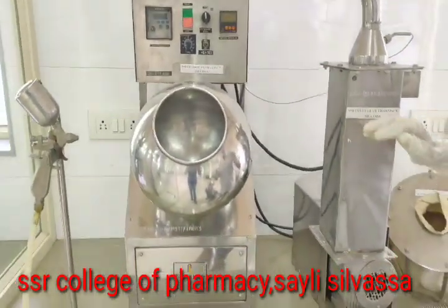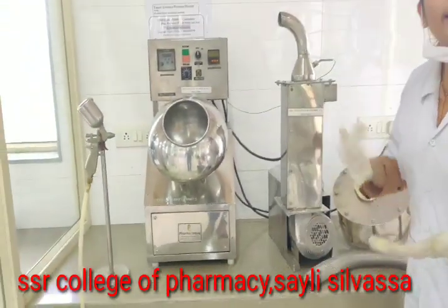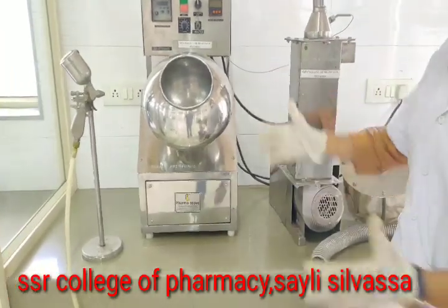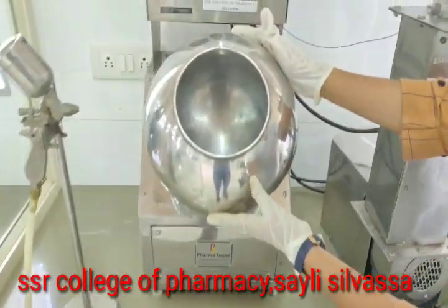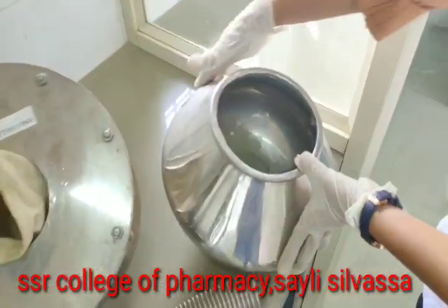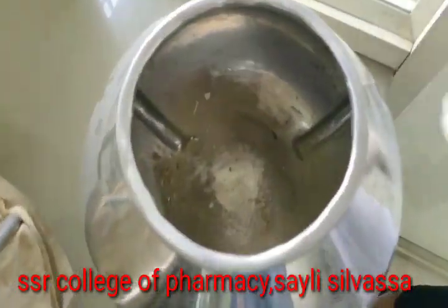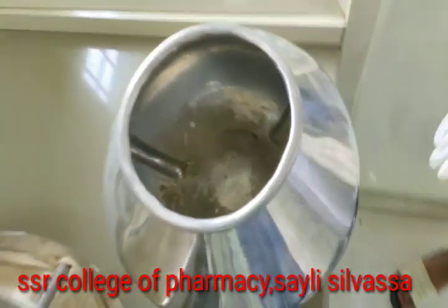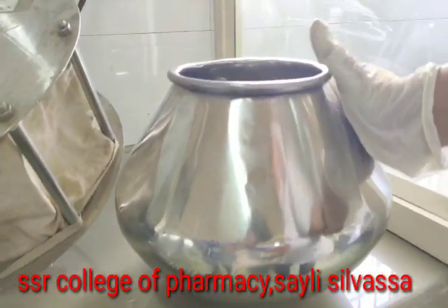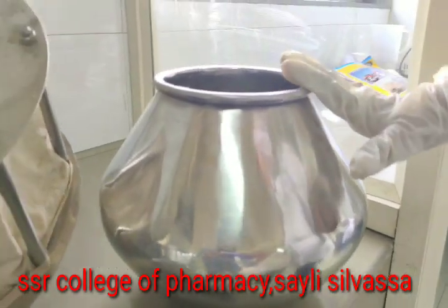This tablet machine has two provisions: one is tablet coating and another is tablet polishing. For tablet coating we have two types of pan — one is a circular pan and another is a baffle-shaped pan, which is used to avoid vortex formation while coating.